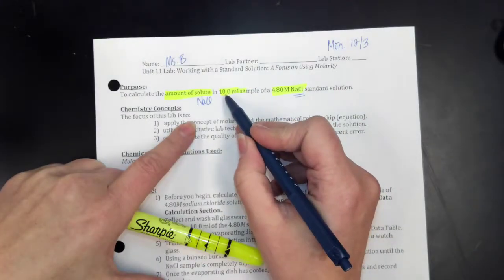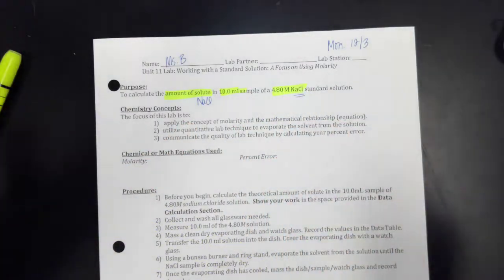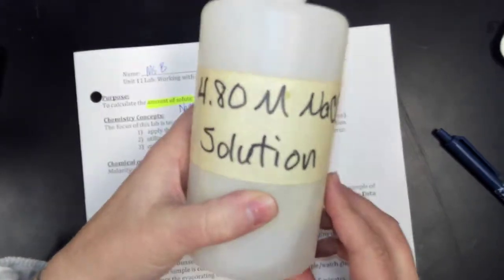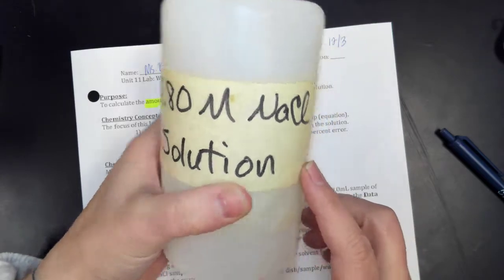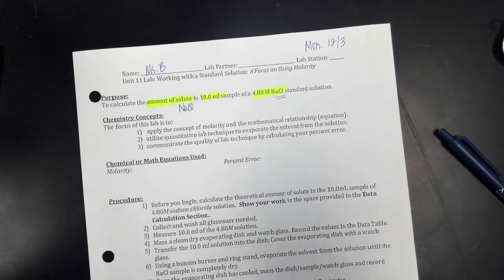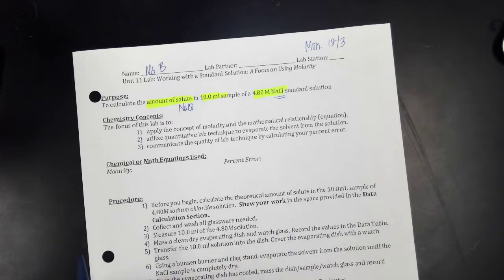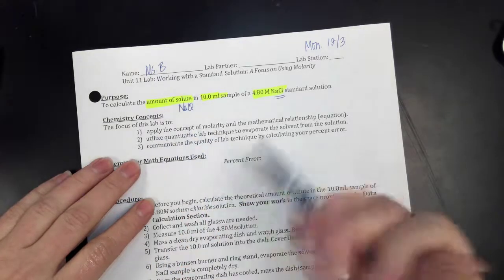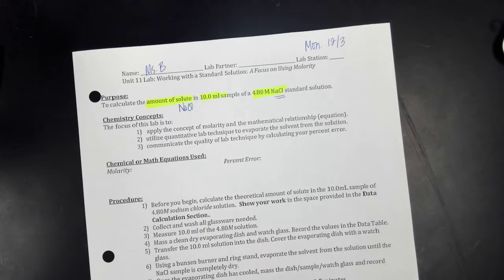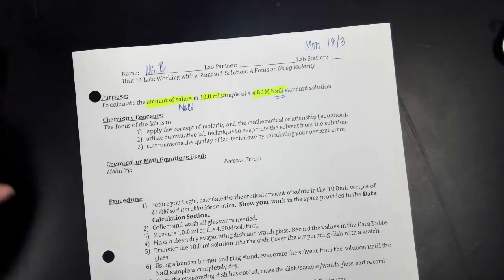I'll be working with 10 milliliters, and I'm going to take this 4.80 molar sodium chloride solution. It is in the fume hood. There are 3 bottles. So you are going to take your stuff to the fume hood when you're getting it, leave them in the fume hood, come back to your lab station. So the focus of our lab today is to apply the concept of molarity and use this mathematical relationship to quantitatively use lab technique to evaporate the solvent from the solution and to communicate the quality of our lab technique by calculating our percent error.